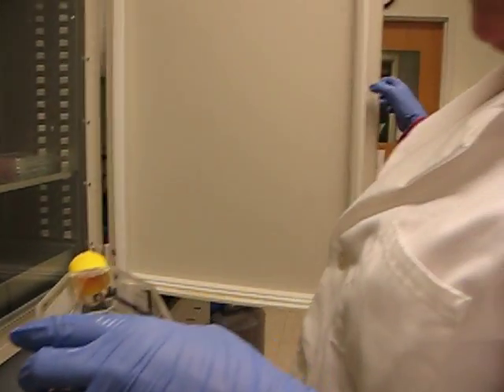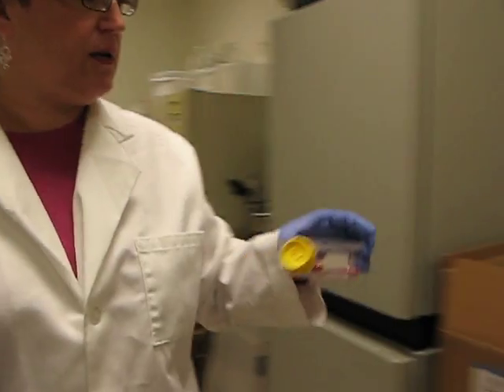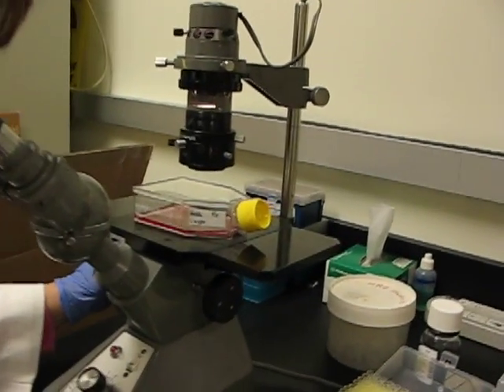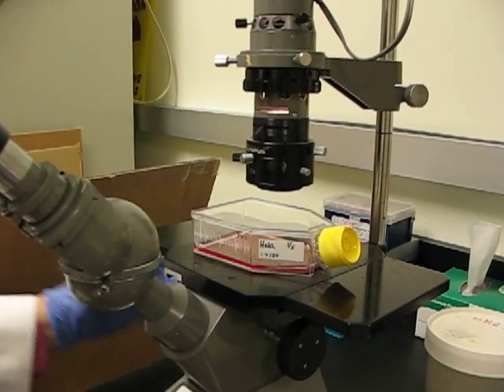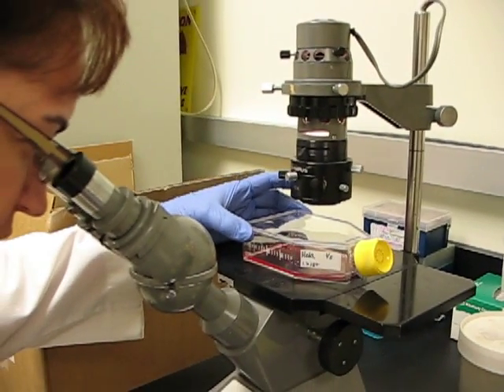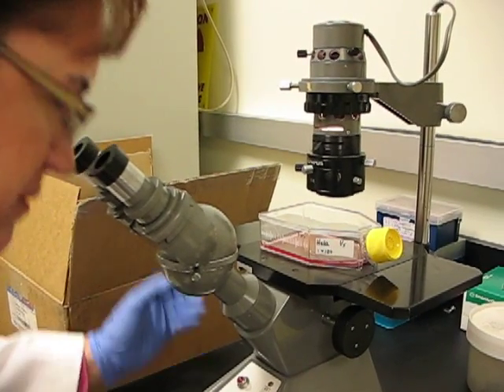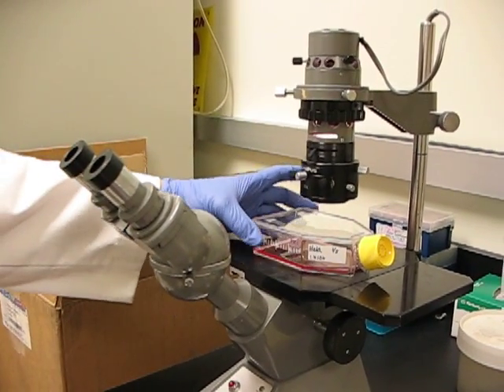Today we're subculturing HeLa cells. I take a quick look at them on the microscope to determine cell health and confluency, so I can make notes in my notebook. These look good. They're about 90% confluent, so they're ready to passage today.